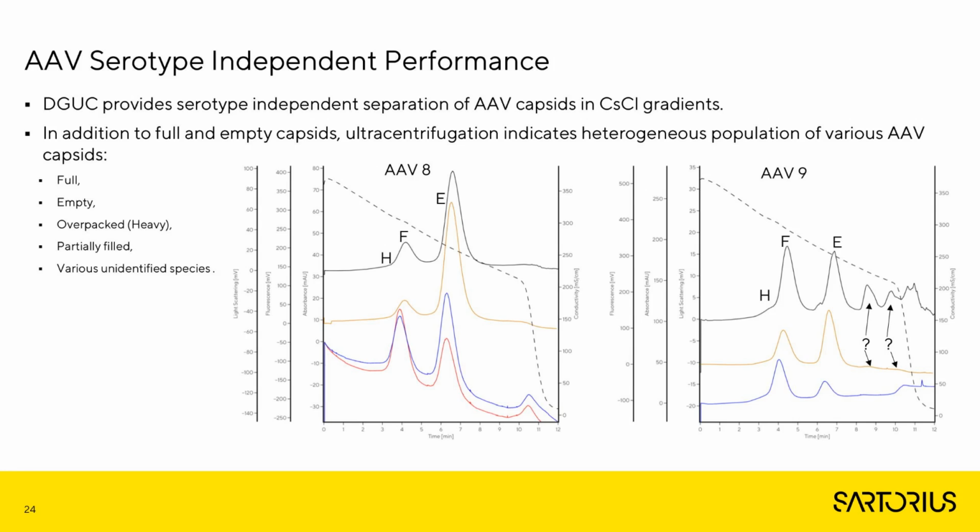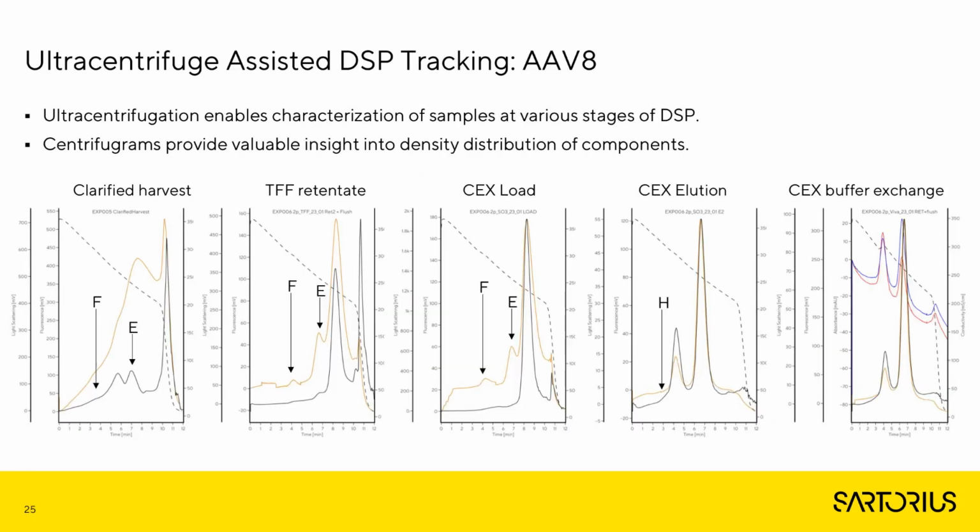Additionally, it turned out that this approach also enables profiling of samples during the downstream processing.